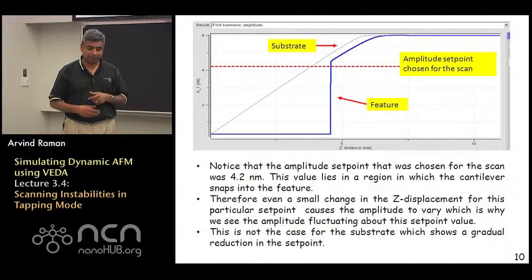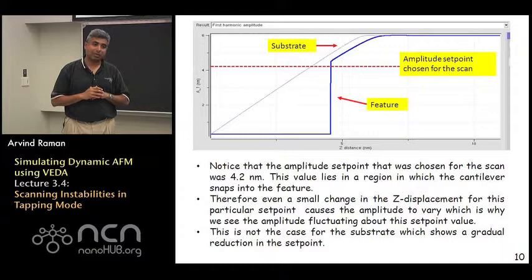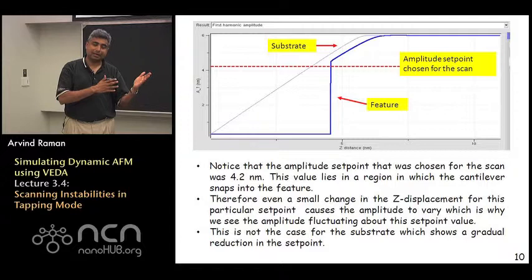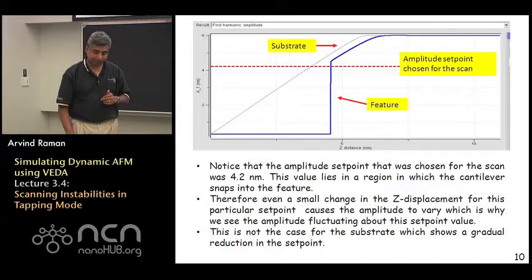So what one could hope to do therefore based on this analysis is that if one chose a set point ratio that lay at a large enough value where you would get stable oscillations both on the feature and on the sample, you might be able to actually image the sample. But do keep in mind that even so the substrate always has a repulsive regime oscillation in this particular simulation whereas the feature is going to have an attractive regime oscillation if you try to image it at larger set points.